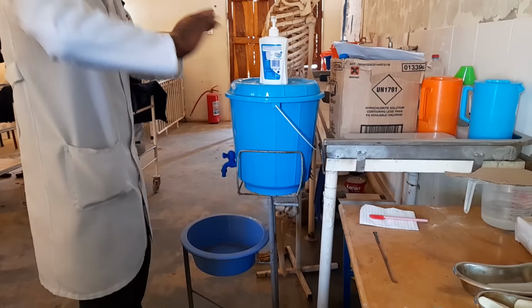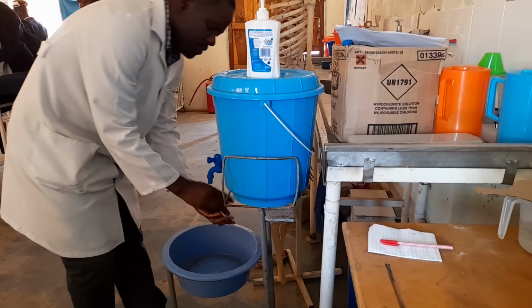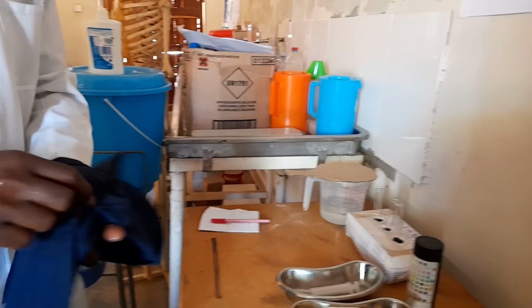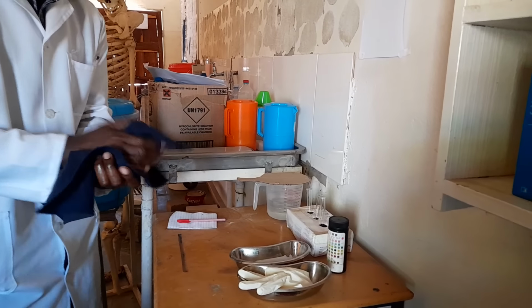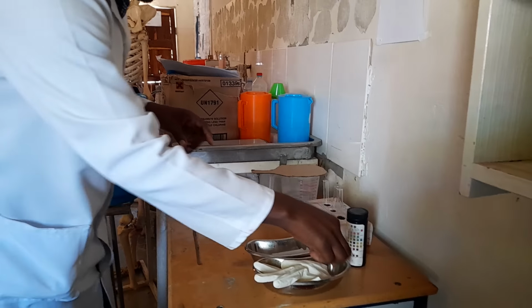So you get soap, 1, 2, 1, 2, like that. Then you rinse. After that, you dry your hands. So you can don gloves.